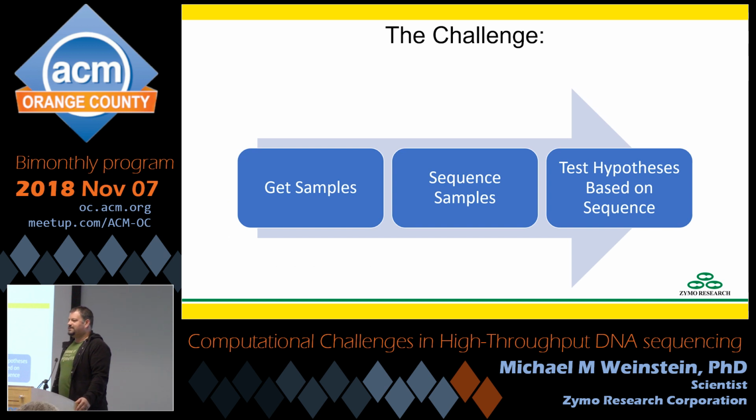So what is the essence of our challenge? The absolute essence of our challenge, if I had to do it as an elevator pitch, is we've got to get samples, we've got to get sequence from the samples, and that sequence could be from DNA or RNA, and I'll get into what those mean in a bit. And we have to test hypotheses based on the sequence.